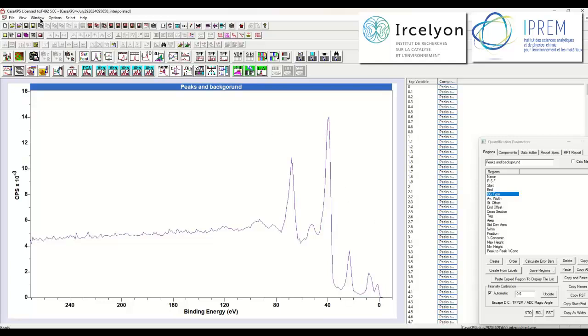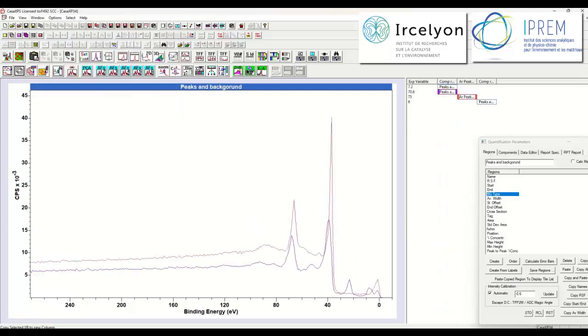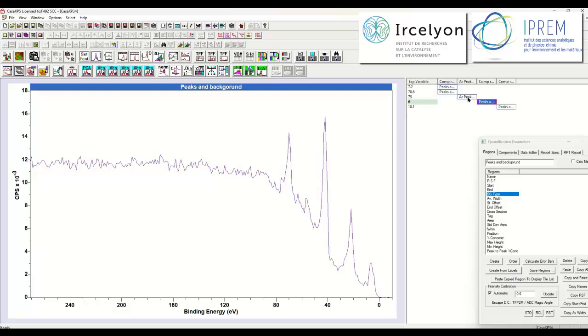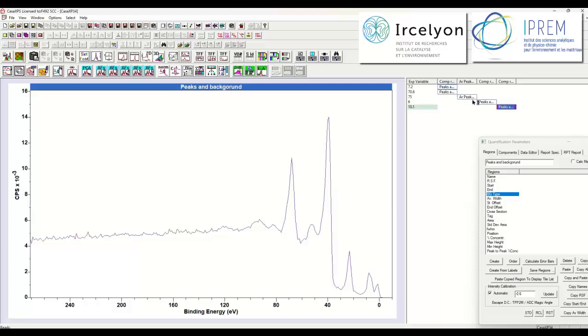So let us copy to the working file yet another example. So this is the first one, this is the first one removing the metal, this is the second one, this is the second one where I've removed some of the metal, and so I now have here three VAMAS blocks containing spectra that are component spectra representing the material of interest to me.